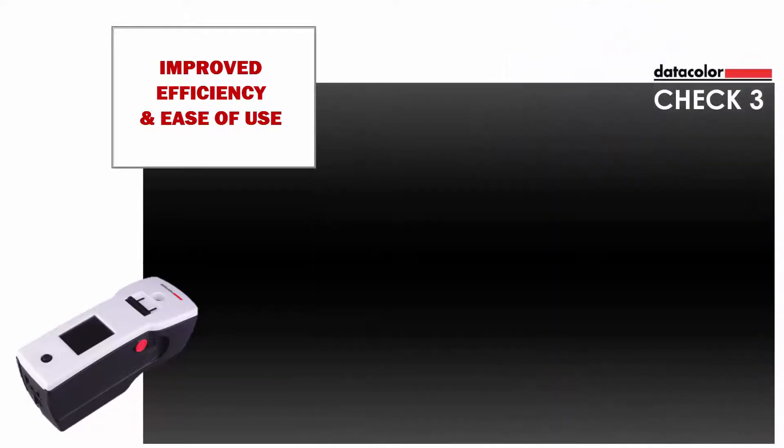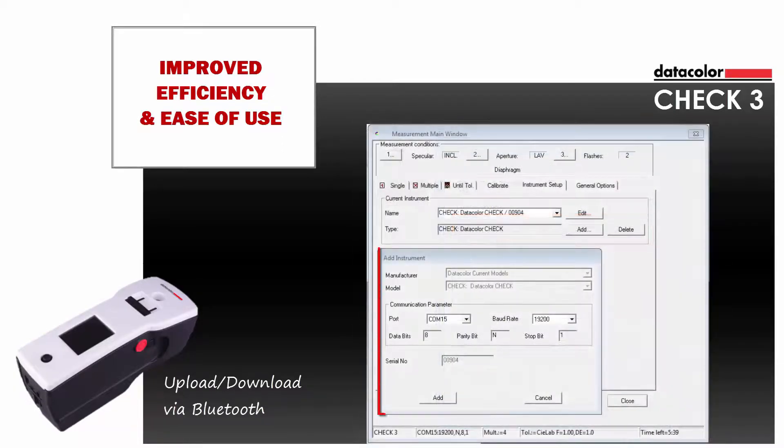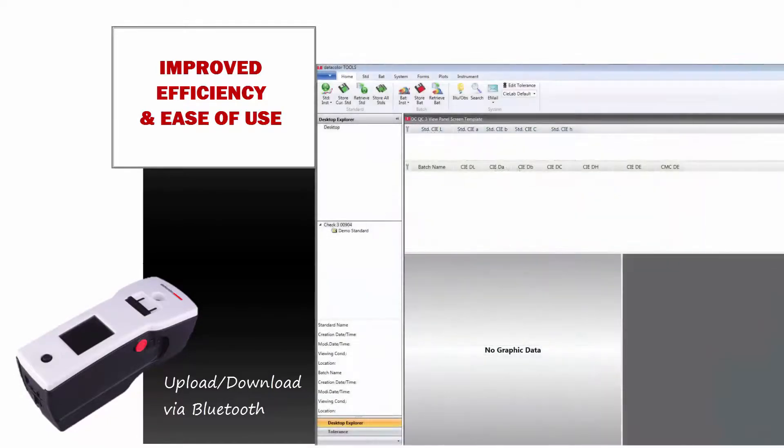The next clip will show the upload-download procedure using Bluetooth communication. This video clip assumes that the user has paired the CHECK-3 unit with the computer via Bluetooth and configured the instrument in Datacolor Tools. After launching Tools, the CHECK-3 unit serial number 904 is listed in the Explorer view. The instrument shows one standard — demo standard — that comes with the unit by default.